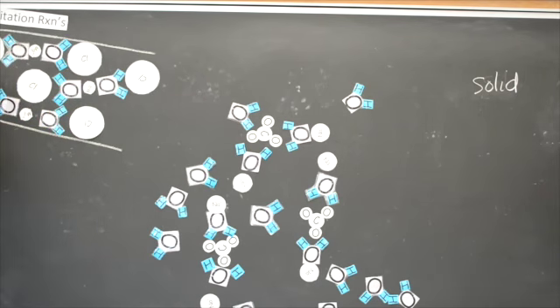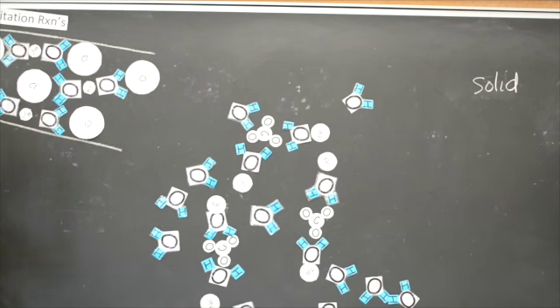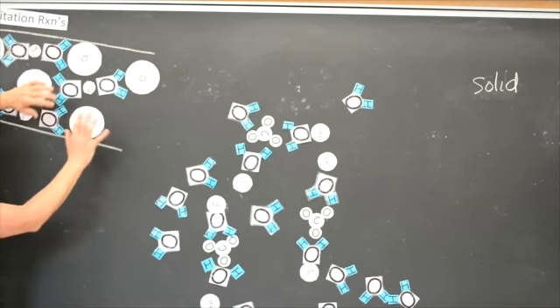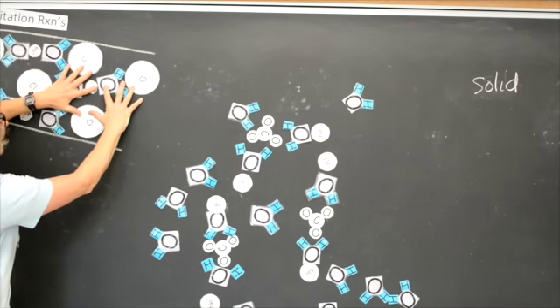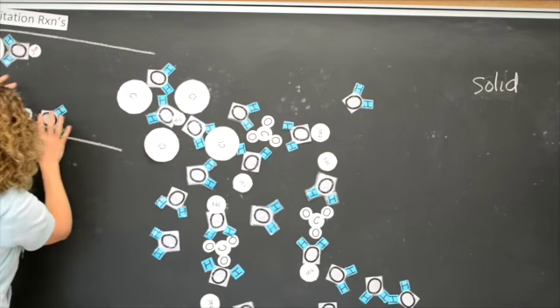And so now let's add into this, because we want to see, what's your prediction? Do you think a precipitate is going to form? We're going to get to a point where you're going to need another piece of information to be able to solve this before you actually do your experiment. So now I'm going to pour my magnesium chloride solution into the test tube. Okay, there's my magnesium chloride coming in.